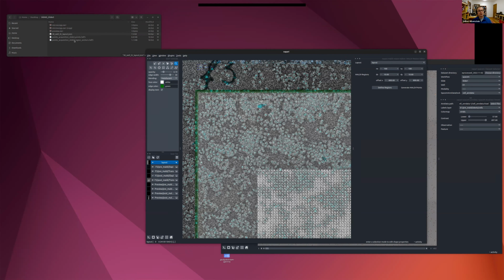And you will also see this is the actual region anchor. So here you can see this is not super accurate. This is still problems with registering to the multi-stage. We hope we can increase that accuracy, and these are the points.